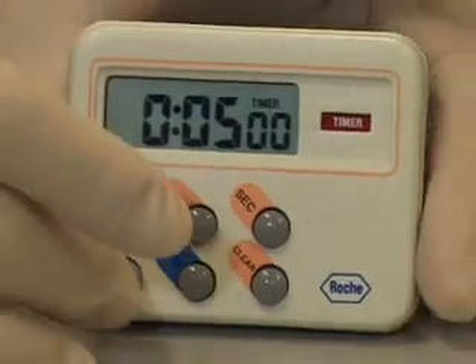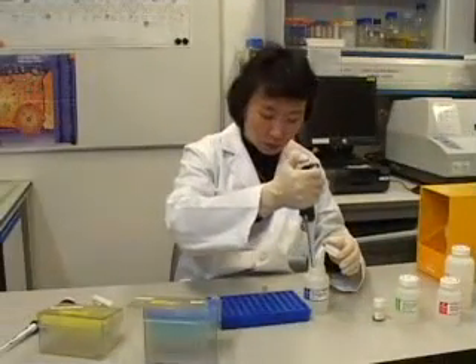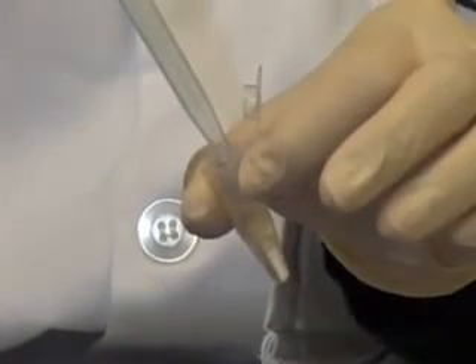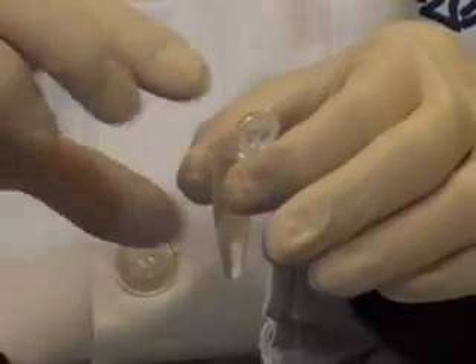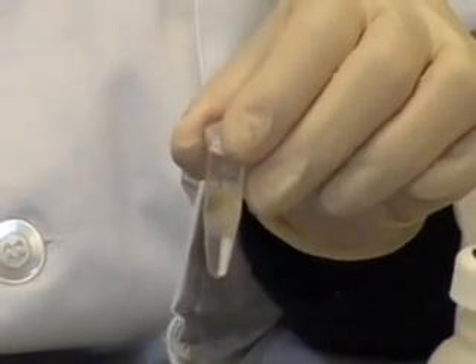Incubate for 5 minutes at room temperature. Do not exceed this 5-minute incubation time. Add 350 µL of neutralization solution and mix by inverting the tube 4 times. Do not vortex.